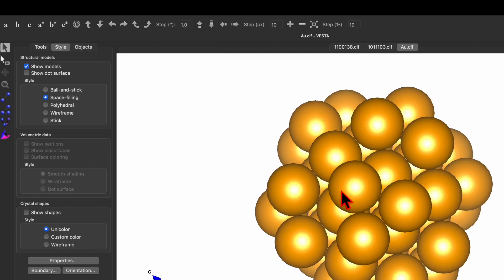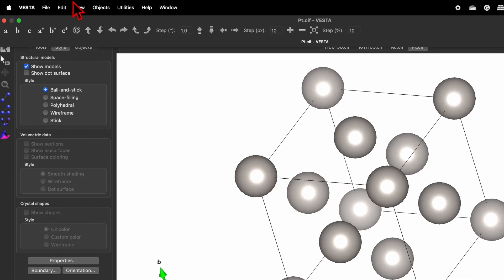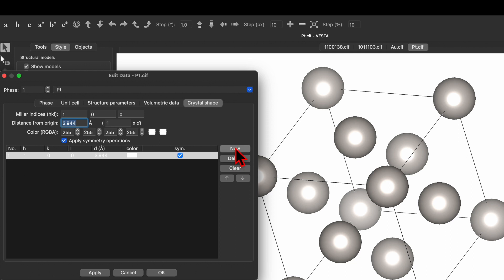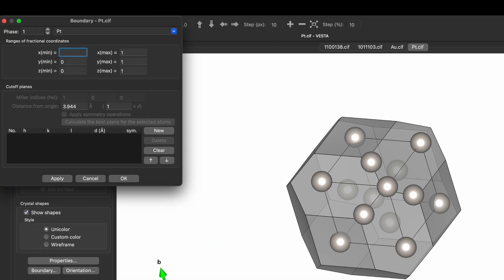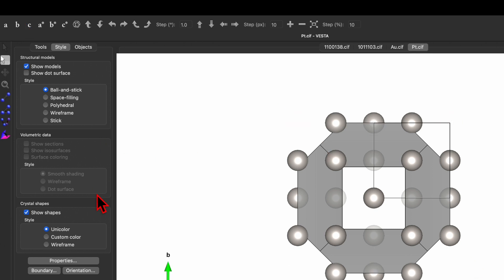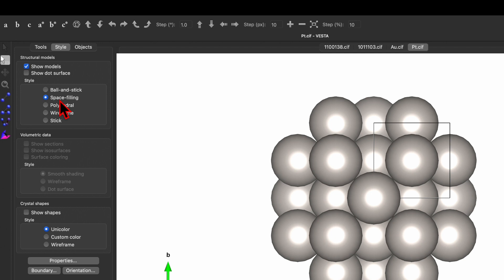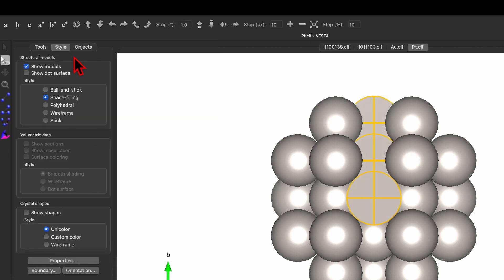Repeat the same process with platinum. Drag the Pt CIF file into VESTA. This is the unit cell. Go to Edit → Edit Data → Crystal Shape, create a new plane — first is 1 0 0, second plane is 1 1 0 — and Apply. Then go to Boundaries and change them from minus 1, minus 1, minus 1 to plus 1, and Apply. Select the white cursor, change plane, delete the atoms outside, then uncheck the crystal shape box. Switch from ball-and-stick to space filling, and in Properties set Unit Cell Line to Do Not Show.